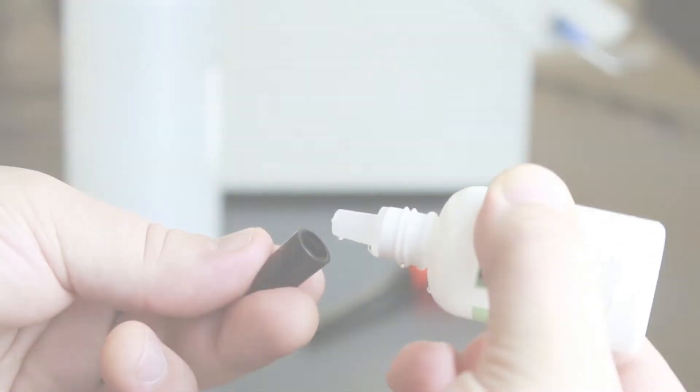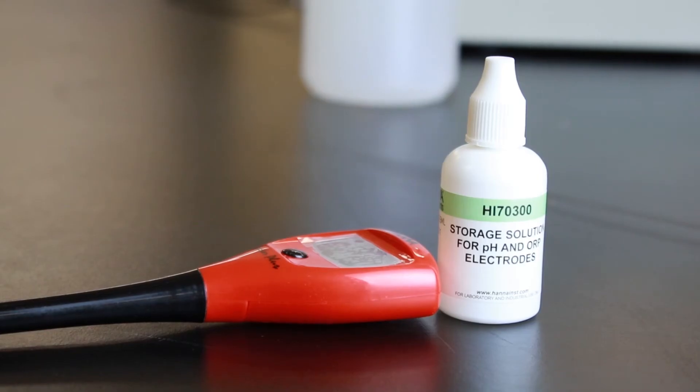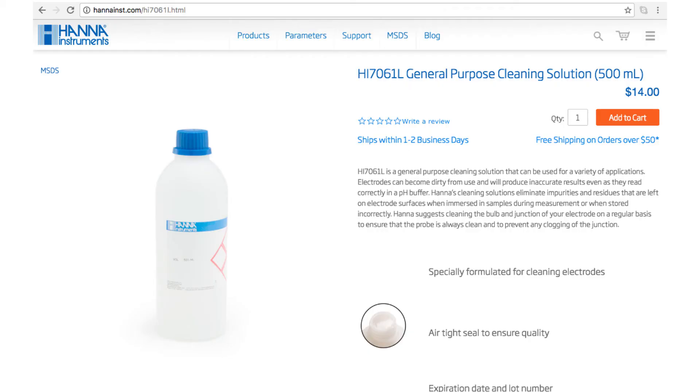When you're not using your tester, keep it in storage solution. Without proper storage, the electrode gets dehydrated. If you don't have storage solution, you can always use pH 4 buffer too. We recommend you clean and store your probe after each use. The HI7061 cleaning solution is what we recommend. Be sure to always clean the electrode before you store it away.